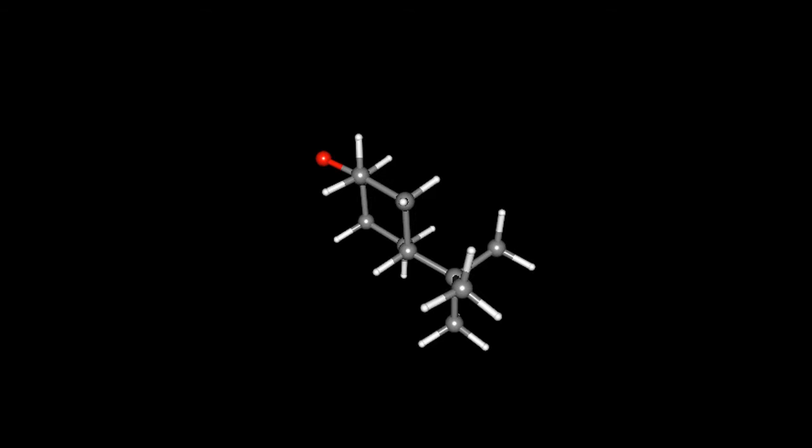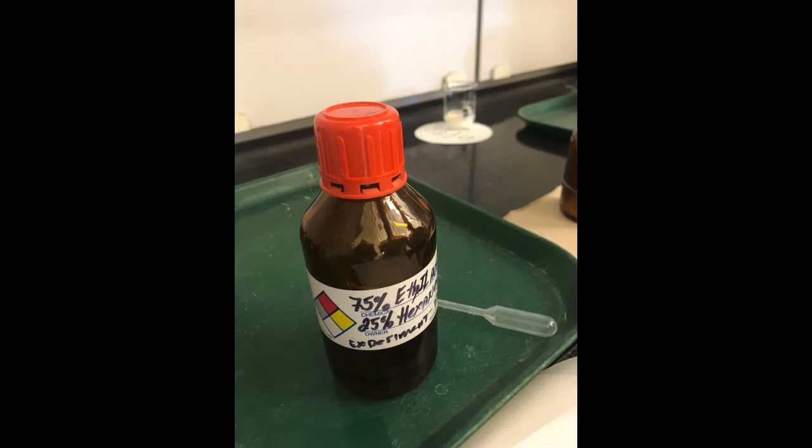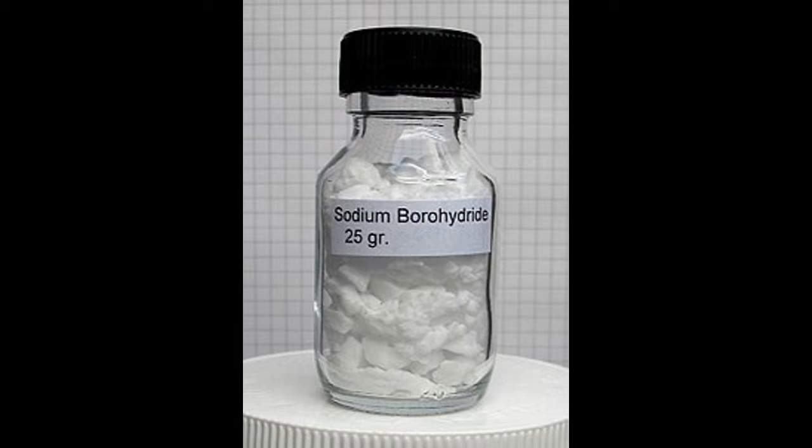The experimental procedure. 0.5 grams of 4-tert-butylcyclohexanone solution and 4 milliliters of 95% ethanol were combined in a flask. 0.3 grams of sodium borohydride reagent, in portions of 0.1 grams, was added to that solution. The temperature was kept below 35 degrees Celsius as it was stirred for 15 minutes.